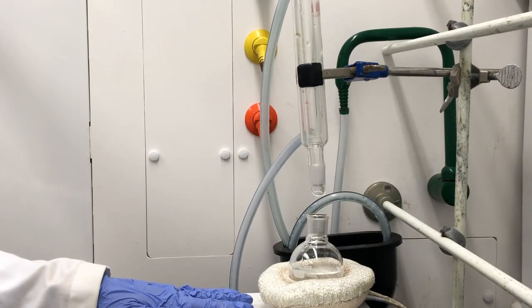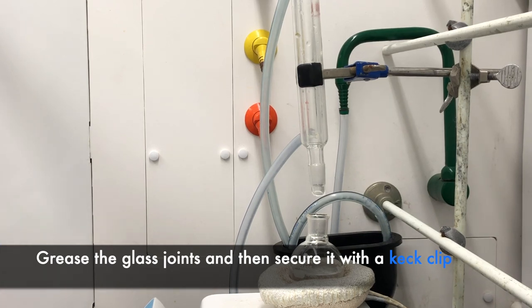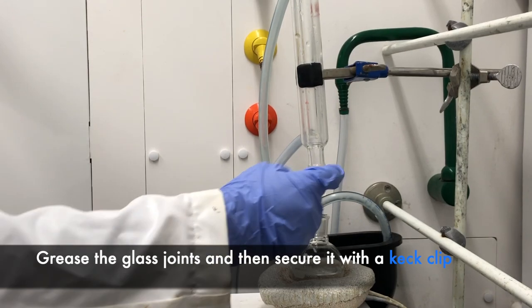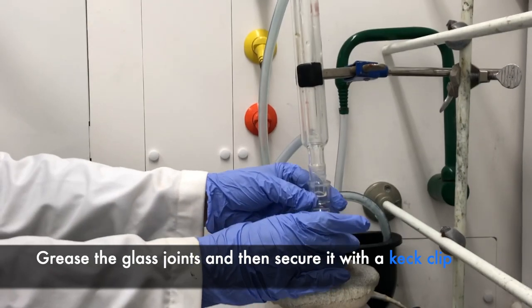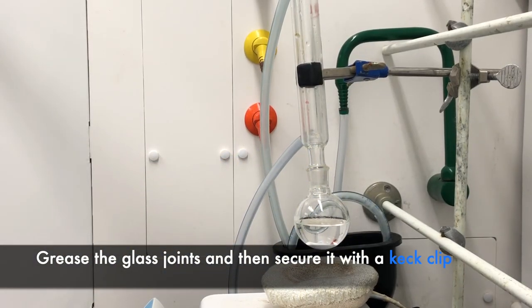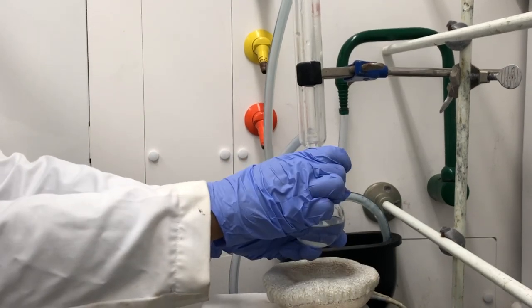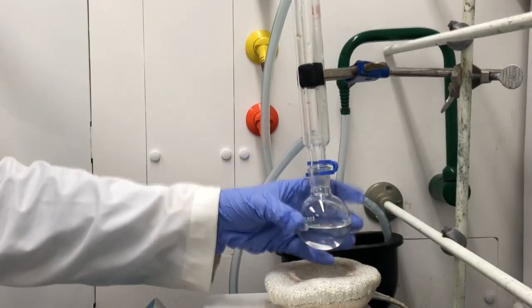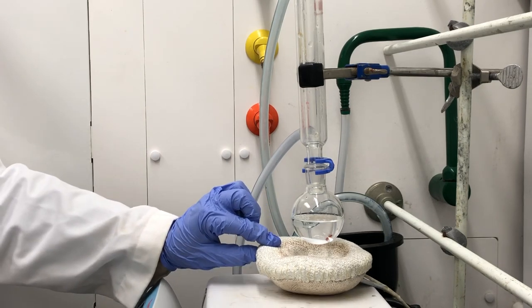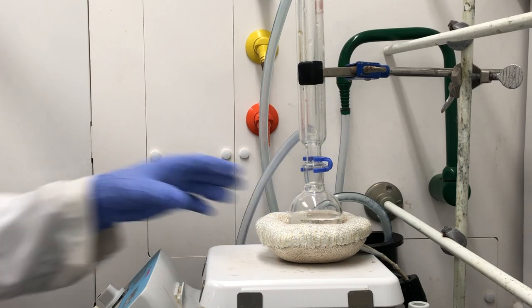Before we raise the jack to clamp the round bottom flask to our condenser, we'll need to grease the glass joints. This ensures that no vapors are escaping and it also makes it easier when we remove the round bottom flask. Then we'll add a keck clip. The keck clips have a wider and a smaller side — all you do is clip it on. Now we can go ahead and raise the jack. I haven't turned on the heat yet; I'm just going to make sure the water flow within the condenser is working fine.